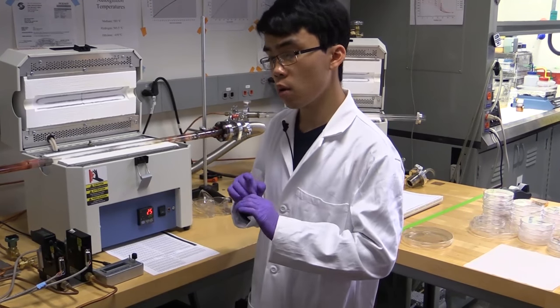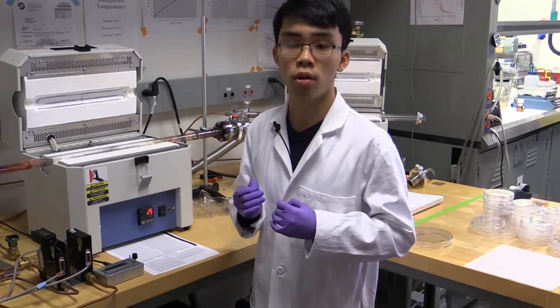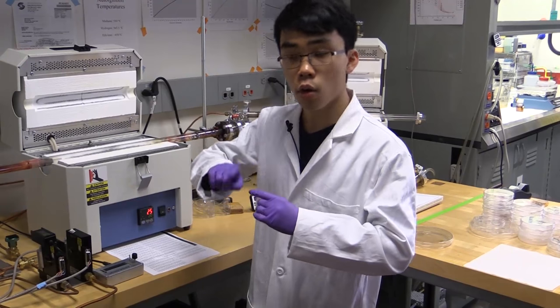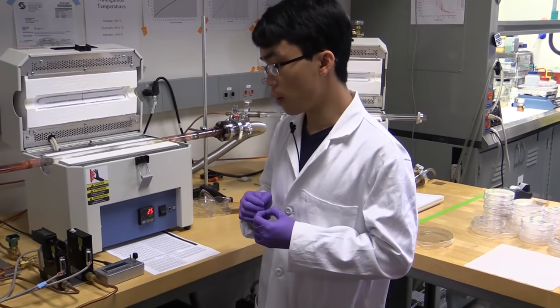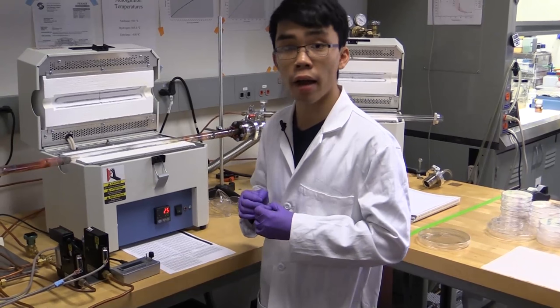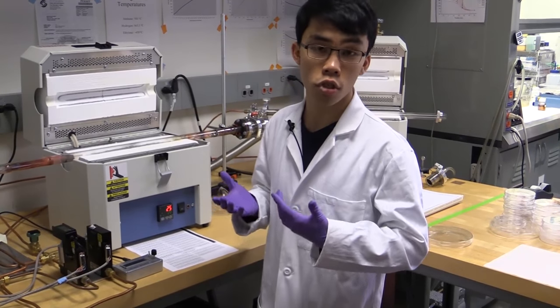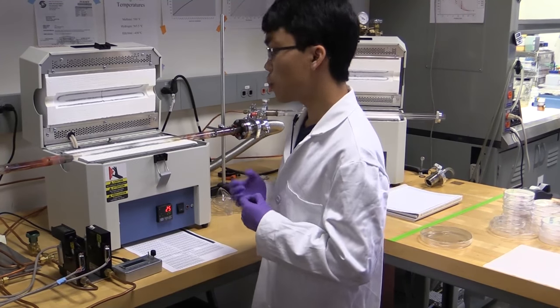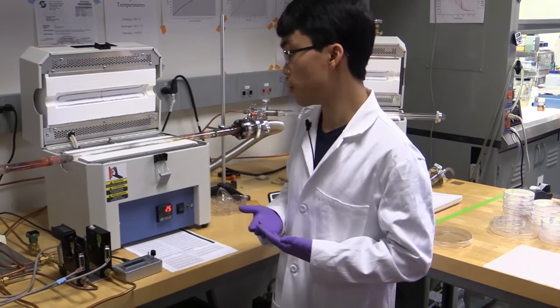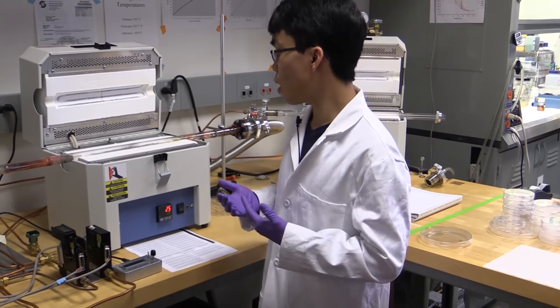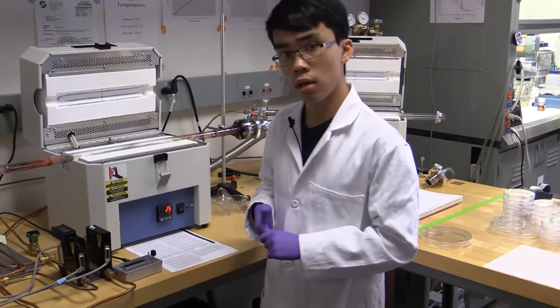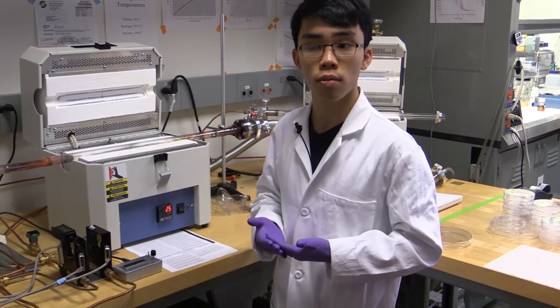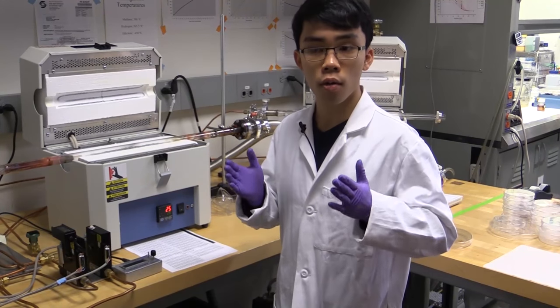In between them, we will have an additional heating coil made from a type N thermocouple that we have simply coiled around at one end. By driving a high voltage through it, we are able to actually heat it up to approximately the source sublimation temperature. Then we can use the furnace's temperature controller to actually heat up our substrate, providing a fully uniform growth area.